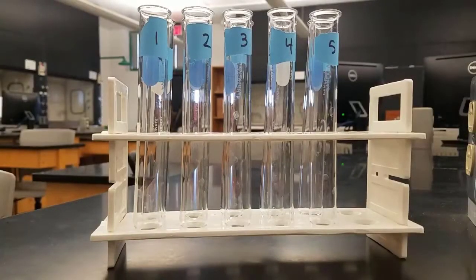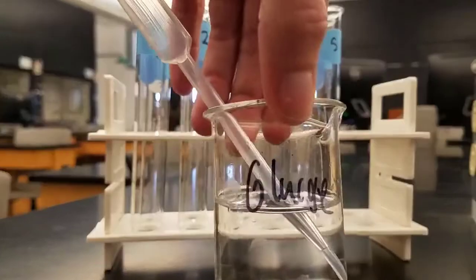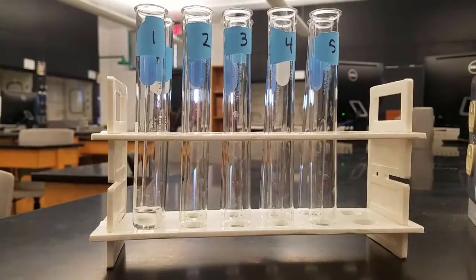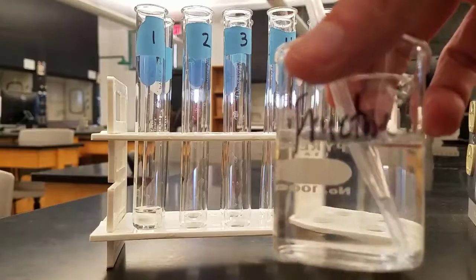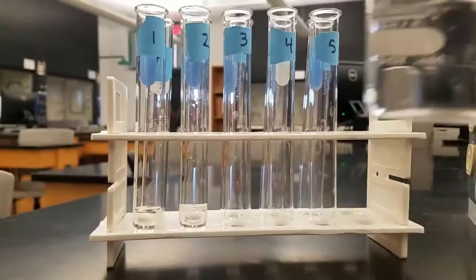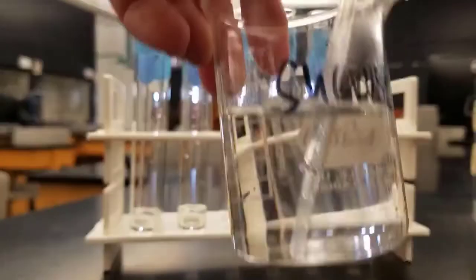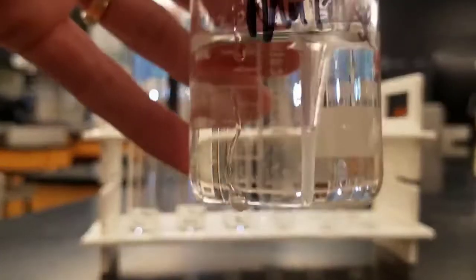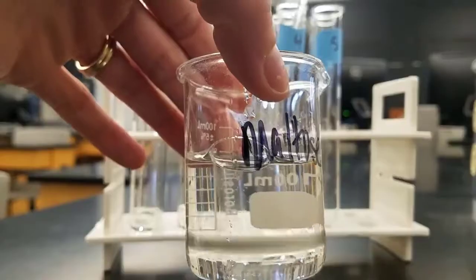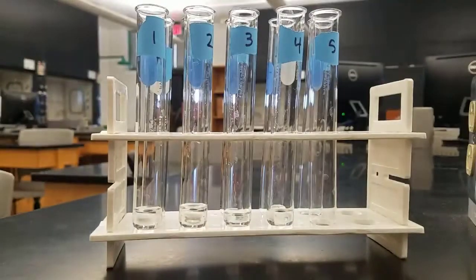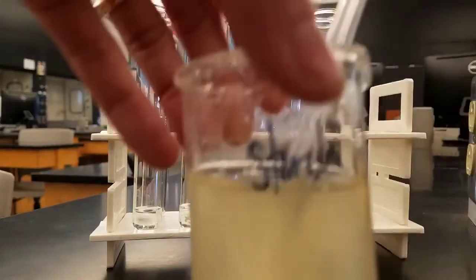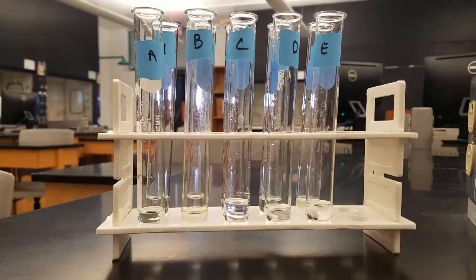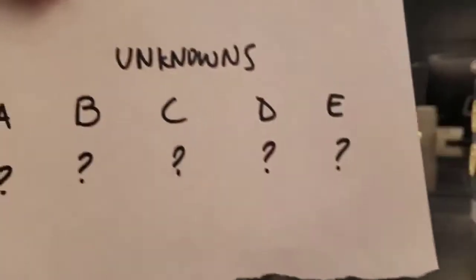For Seliwanoff's test we follow the procedure for part B. First, we add one milliliter of sugar solution to each test tube: glucose into the first, fructose into the second, sucrose — table sugar dissolved in water — into the third, maltose into the fourth, and the polysaccharide starch into the fifth. You can see starch doesn't fully dissolve, so that solution is a little cloudy.